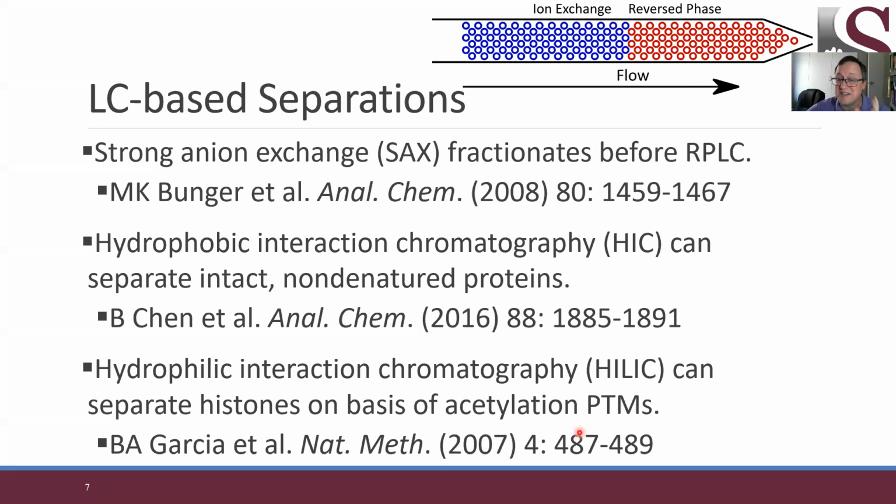Okay, they have the same three letters starting their names: hydrophobic interaction chromatography, hydrophilic interaction chromatography, and yet one of them goes by the name HIC, hydrophobic interaction chromatography, and the other one goes under the abbreviation HILIC. So if you see HILIC, you can always remind yourself that it rhymes with hydrophilic. I hope that helps. So we have different ways that we can do these separations, and by making these mixtures separate into different protein collections, we have a much better shot of separating them well when it comes to introducing them to the instrument in reverse phase liquid chromatography.